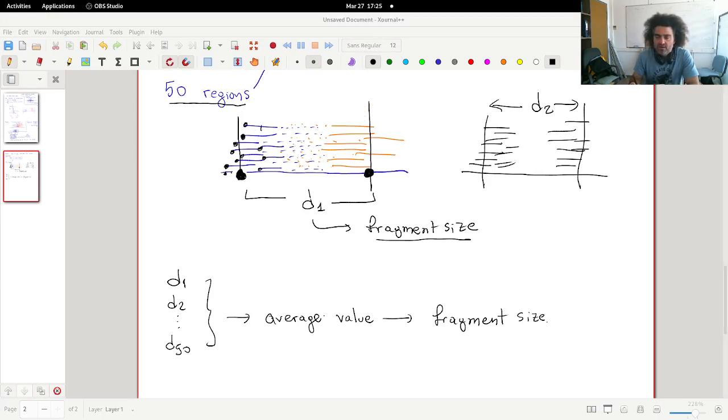I just read in a paper that instead of taking the beginnings here, it might follow the following procedure. So to find how many reads we have in each location, and therefore make a distribution of the number of reads in each location. So for example, here we have 1, 2, 3, 4, 5, 6, 7, 8, 9, 10 reads. There are more reads here from the plus strand. And somewhere here we might have more reads, so another distribution here.